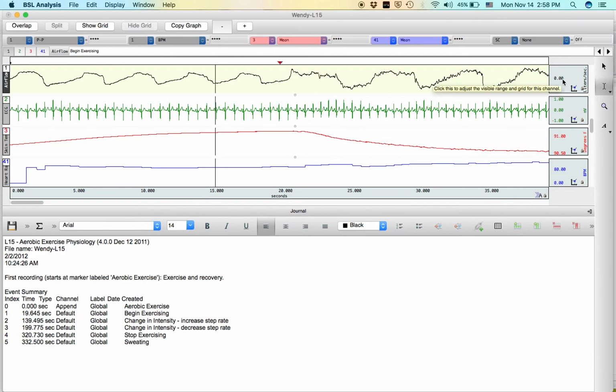So we're going to be considering absolute values as we go below 0, but 0 meaning that the rate has stopped. For example, the waves above 0 are exhales, and then it approaches 0 as you stop the exhale and begin the inhale.